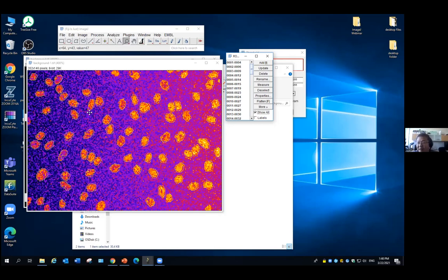Then you go back to your microscope, change the parameters, and get a better image. Then you do the analysis again. By the end, you find the right protocol on the microscope side. That guarantees you'll get the best raw data you can. Then you begin to take all your images, and then you do your analysis. That makes your life actually much easier later. Just try to spend more time at the beginning to make sure you get the best raw data and you get the analysis protocol on the digital side to give you reliable results.